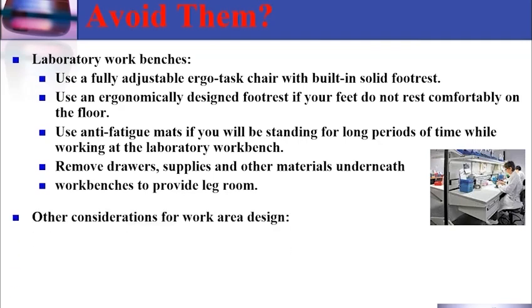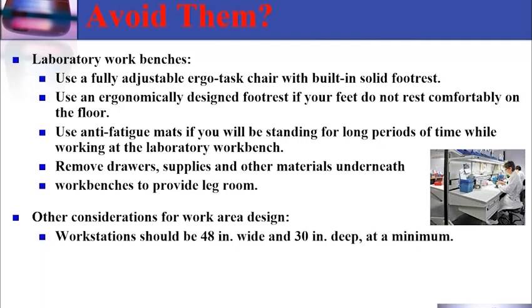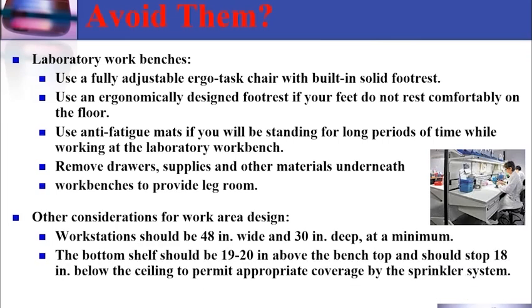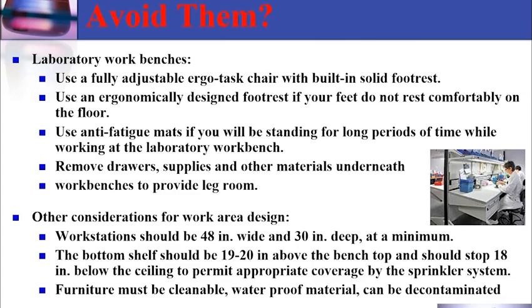Other considerations for work area design. Workstation should be 48 inches wide and 30 inches deep at minimum. The bottom shelf should be 19 to 20 inches above the bench top and should stop at 18 inches below the ceiling to permit appropriate coverage by the sprinkler system.